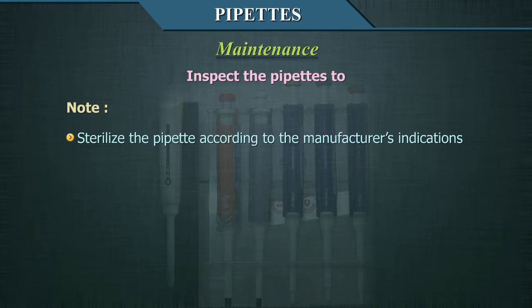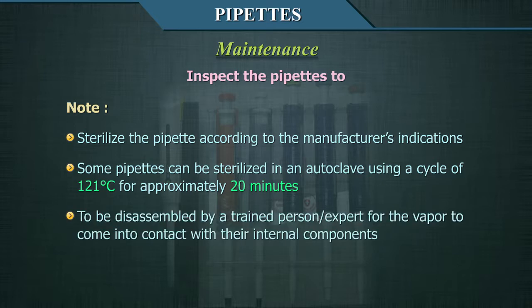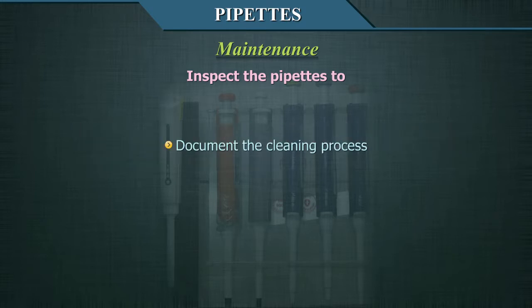Sterilize the pipette according to the manufacturer's indication. Some pipettes can be sterilized in an autoclave using a cycle of 121°C for approximately 20 minutes. Some will need to be disassembled by a trained person for the vapour to come into contact with their internal components. If a pipette has been used with harmful substances, it must be completely decontaminated before being used in other procedures or removed from the laboratory. Document the cleaning process.